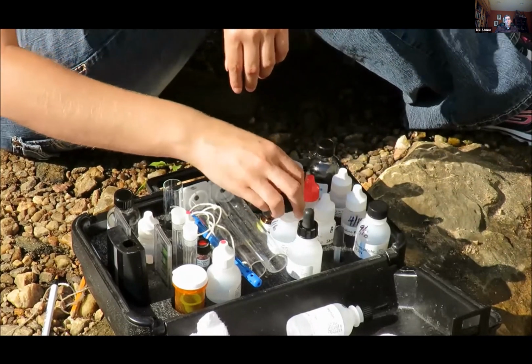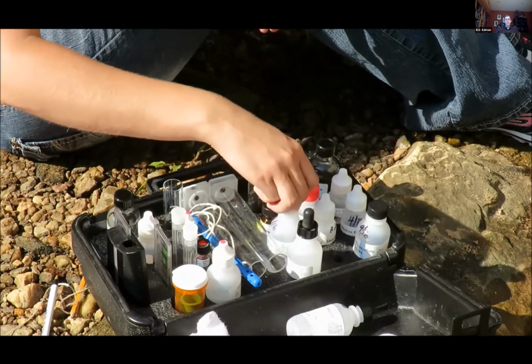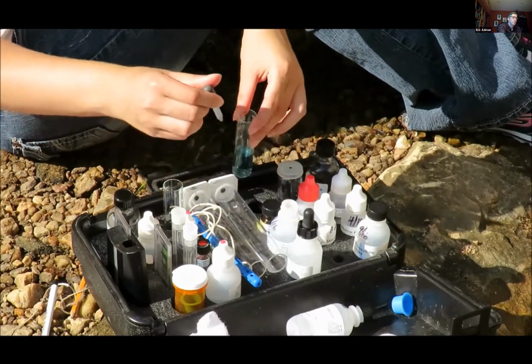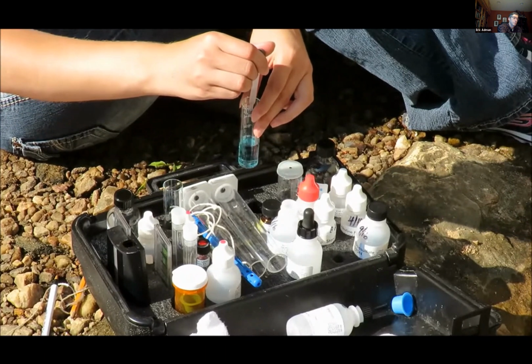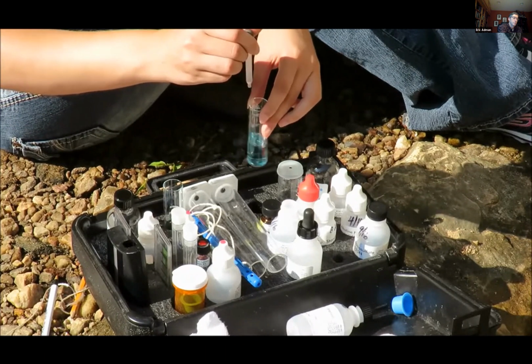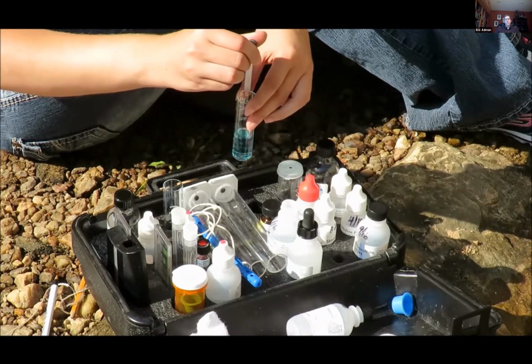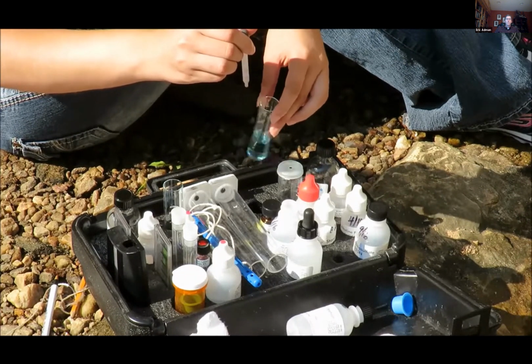Locate the plastic dropper with the orange or black bulb. Also, locate alkalinity titration reagent B. Fill the dropper with the reagent. Hold the dropper vertically and add 1 drop at a time to the water sample in the tube. Swirl to mix between each drop. Be sure to allow time between drops for color change to occur, especially during cold weather. You will need to know how many drops you add to your sample, so don't forget to count.